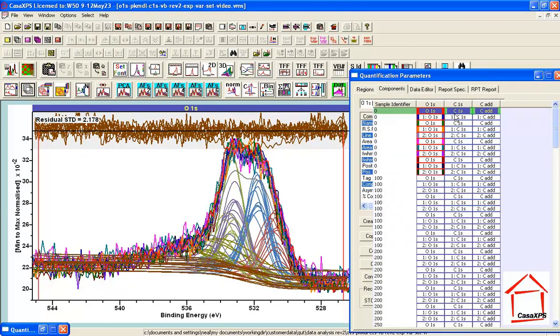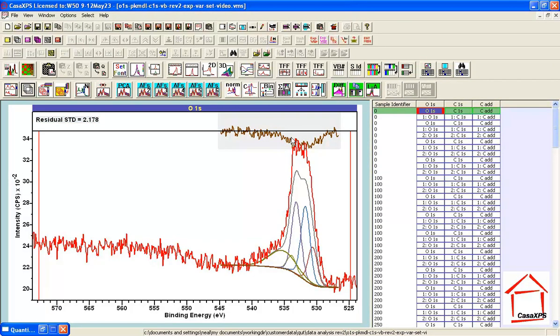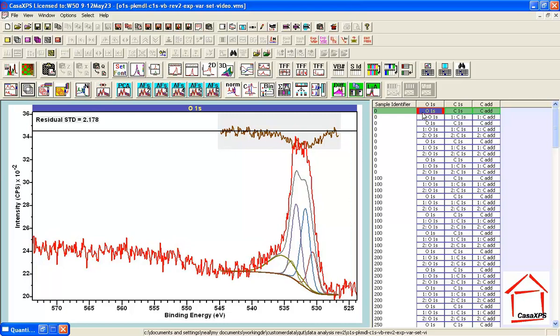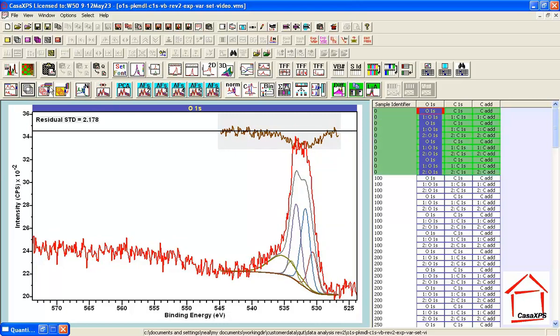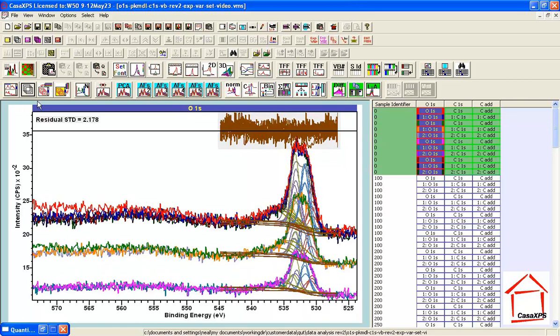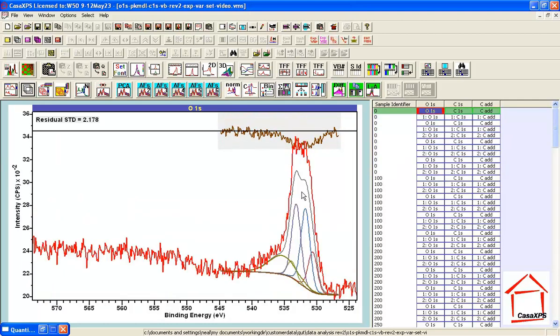A new peak model has been defined for the first selected spectrum. The first spectrum and the fit don't really align — and that's because we had double normalization on, so each spectrum was displayed within its own scale. Turning that off and overlaying the data, it's clear these spectra actually had different intensities as measured. These data represent different points on the sample, slightly different acquisition conditions, maybe sample height — something made the intensity change.